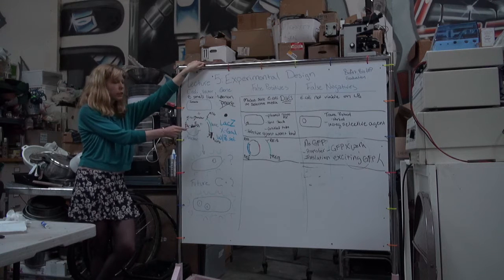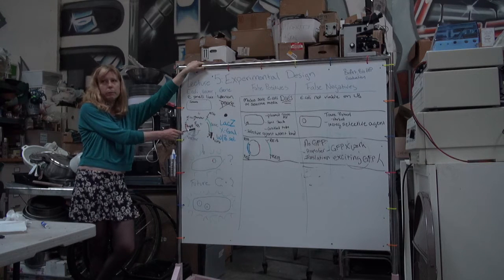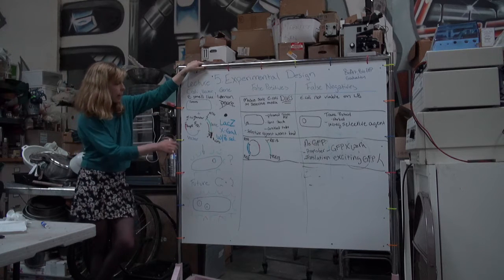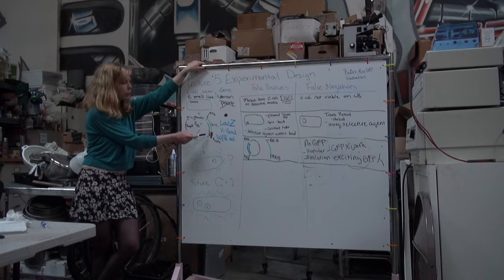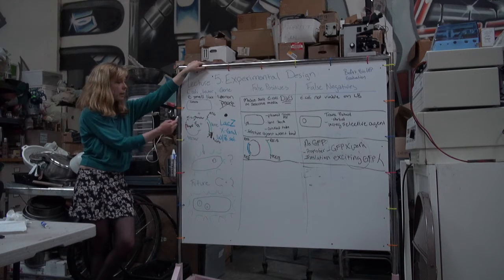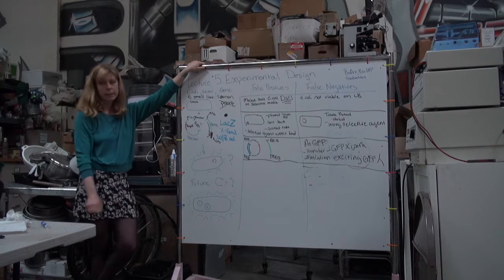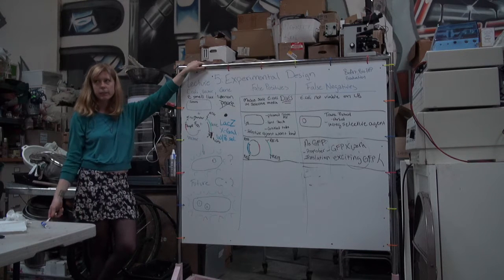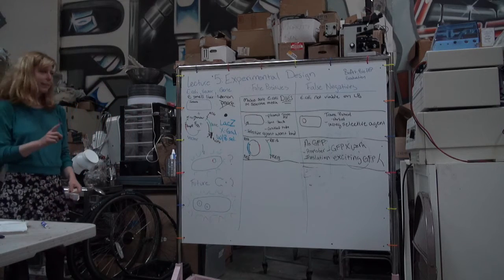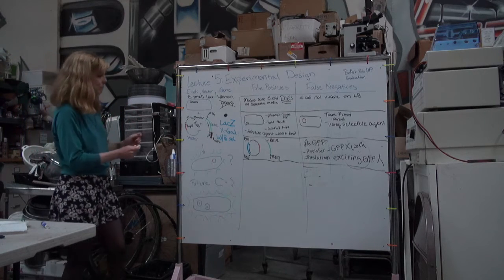It'd be nice to make sure that GFP works in your lab. But I wouldn't necessarily put my gene of interest with GFP as its tag into a vector that has GFP as a tag. It could get confusing. You want it to be only one thing potentially going on.